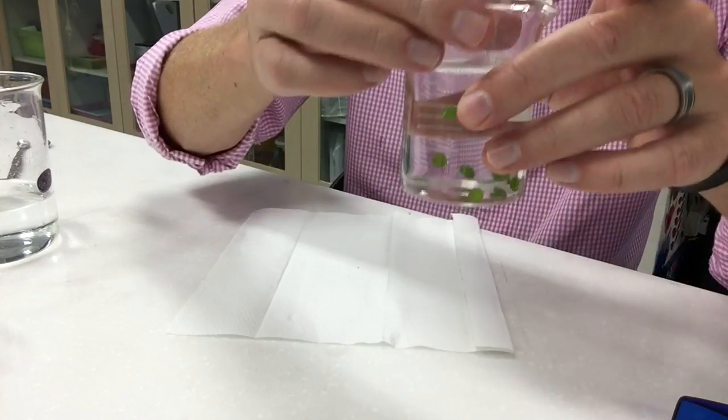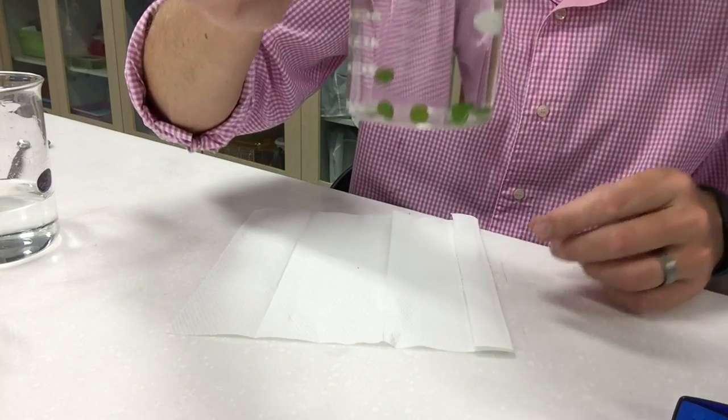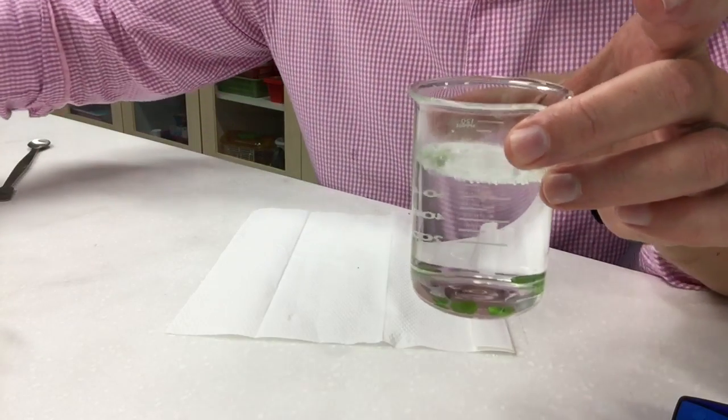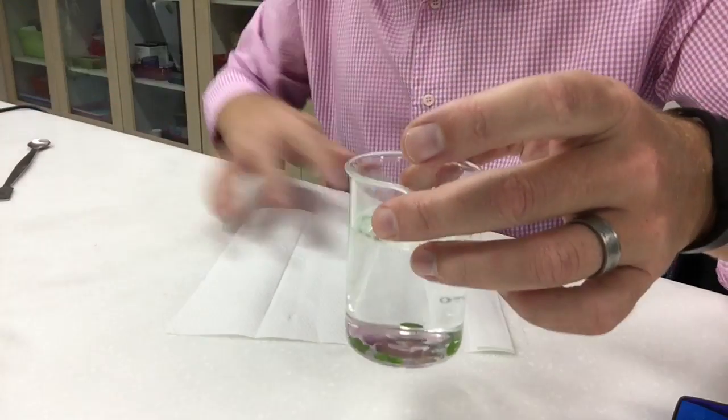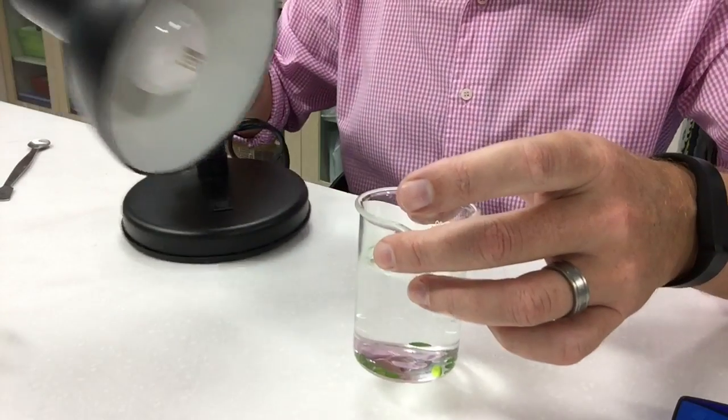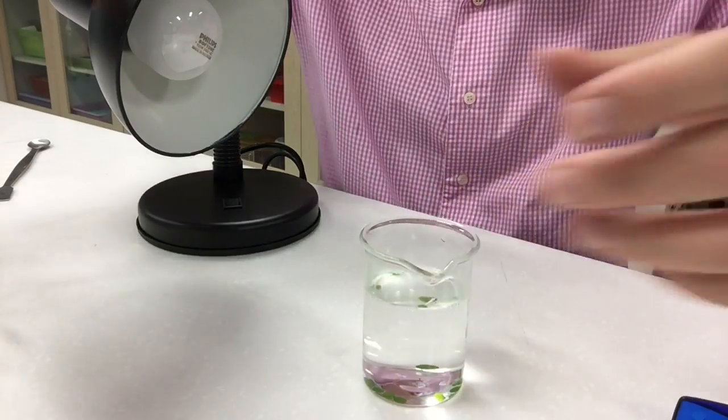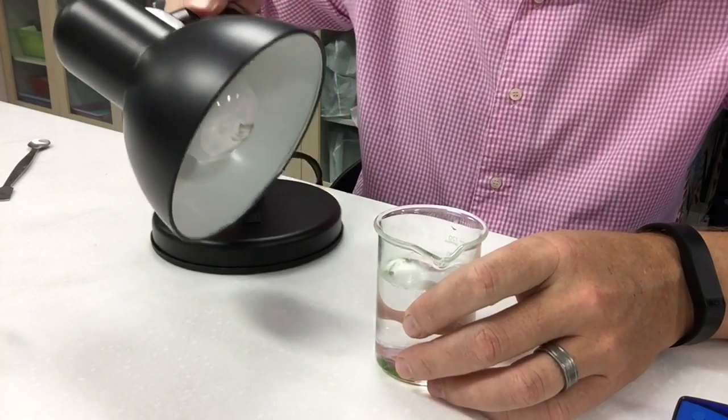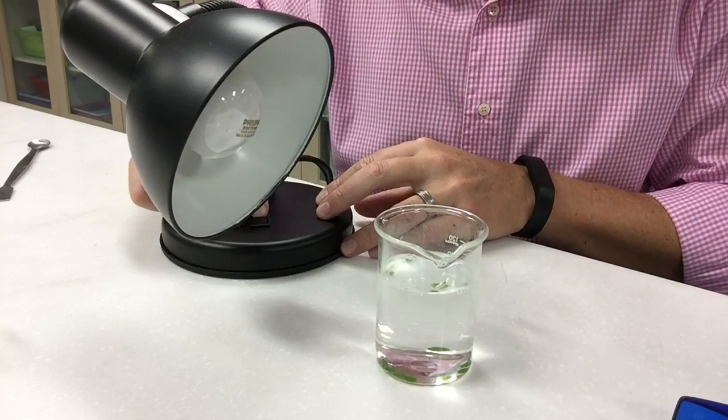Once they've all gone down to the bottom or the most of them have gone down to the bottom, again you don't have to have them all down but those things have sunk down nicely, then what you want to do is set up your lamp and turn it on. Now you're going to want to measure the distance.